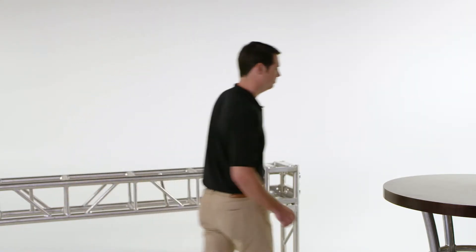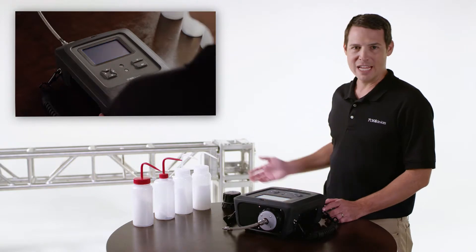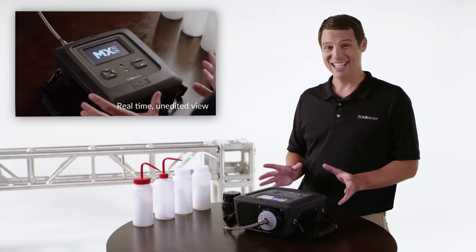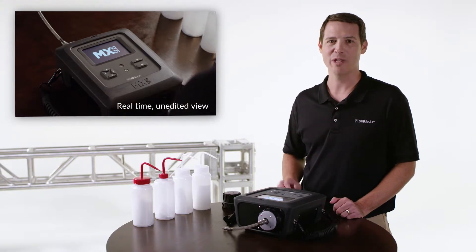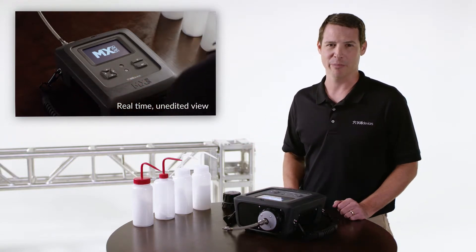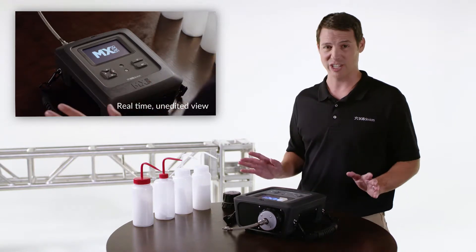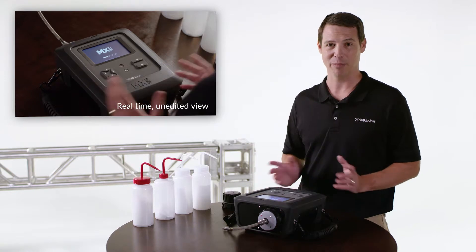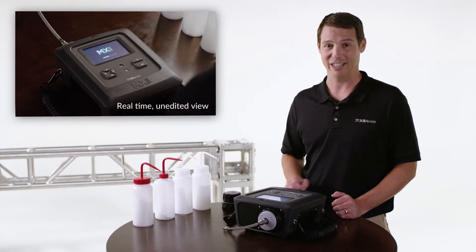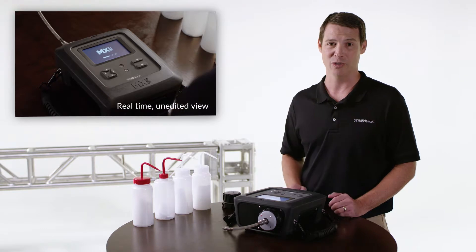Let's run some samples. Here you'll see a real-time unedited view of operation. A few quick facts while we start up: size — this is the world's smallest mass spectrometer, more than 20 pounds lighter than comparable field instruments. The threat list, now at over 100 items, will continue to grow throughout the lifetime of the product. Some folks think of MX908 like a multi-gas monitor with over 100 sensors all running simultaneously that never need to be replaced or calibrated. There are hundreds of HPMS instruments like this in the field, with at least one in every US state, deployed across four continents, already in use by military and civilian users all over the world.